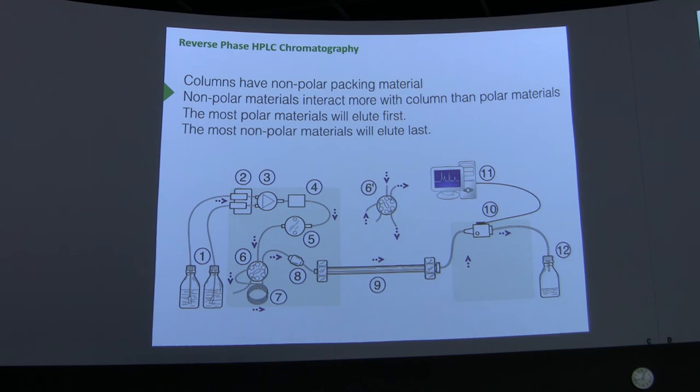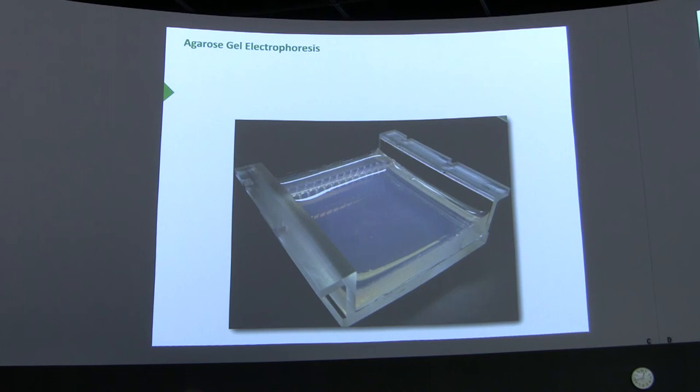Okay. Well, now we turn our attention to another kind of separation. It's not something we call chromatography, but we call electrophoresis. And I imagine most of you in here, how many people have run a gel? Almost everybody, yeah, okay. So, you know what a gel is. You know it looks like Jell-O, right?